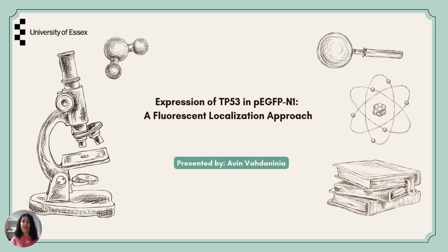Everyone, my name is Avin Vahdaninia and today I will be presenting my project on the expression of TP53 in pEGFP-N1, a fluorescent localization approach. This project focuses on cloning TP53 cDNA into a mammalian expression vector to study its localization in cells.